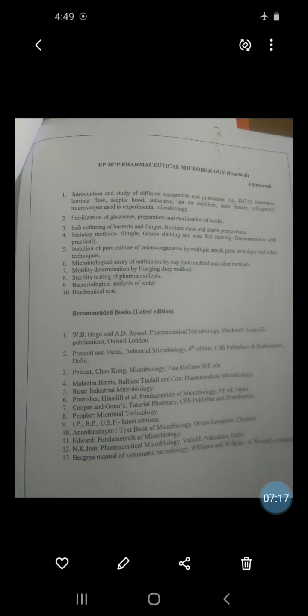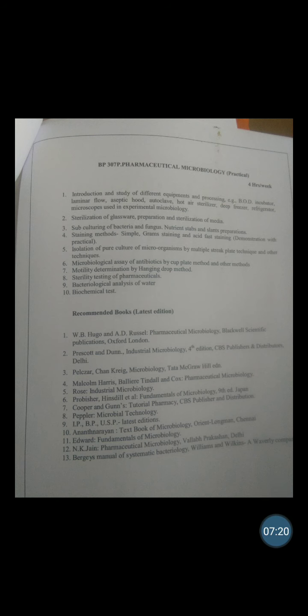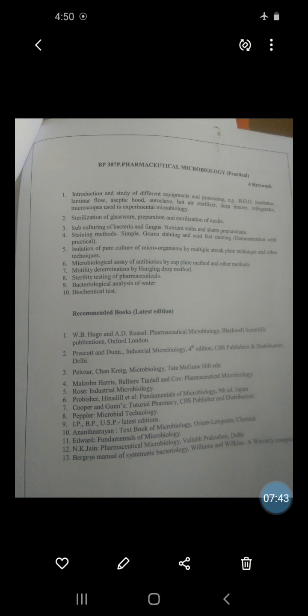And last, observe the slide under the microscope for motility. The conclusion is, if the bacteria show presence of flagella, then it is motile, and if they show absence of flagella, then it is non-motile. By the motility test, we can easily differentiate between motile and non-motile bacteria, and this is a very important step for identification of bacteria on the basis of different properties.